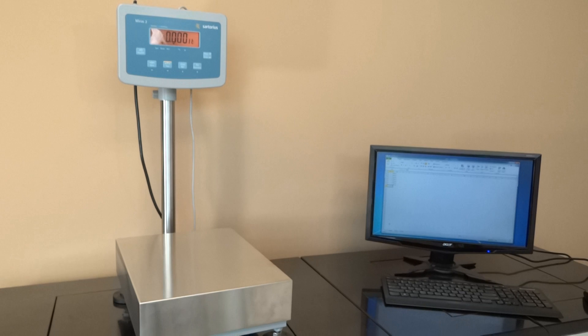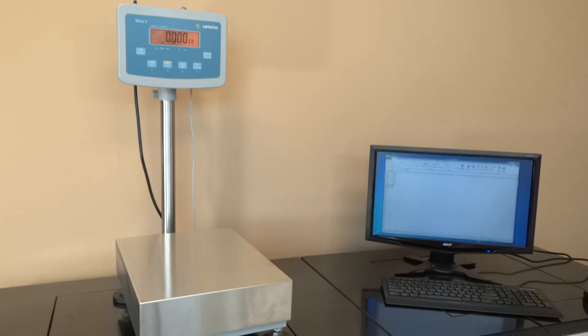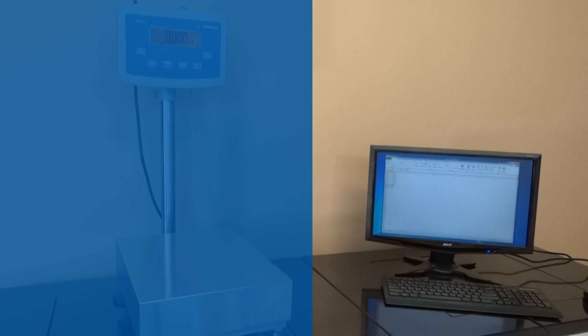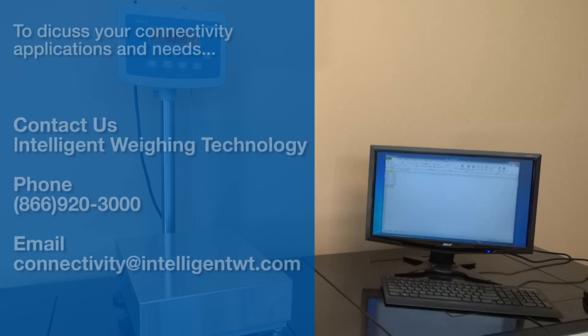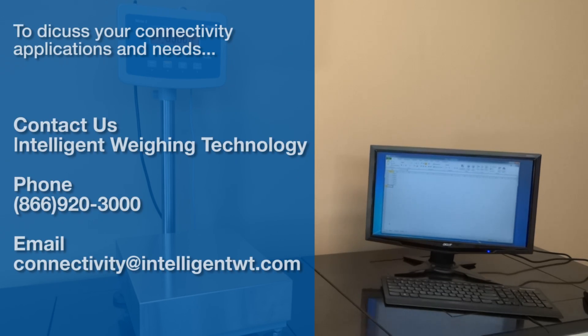Intelligent Weighing Technology is a value-added connectivity integrated distributor. We provide consultation services for the best connectivity solutions for your applications.